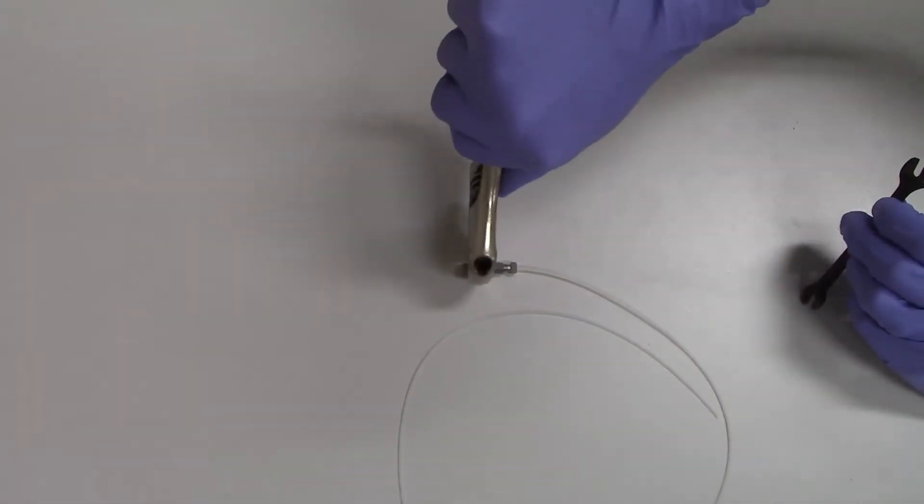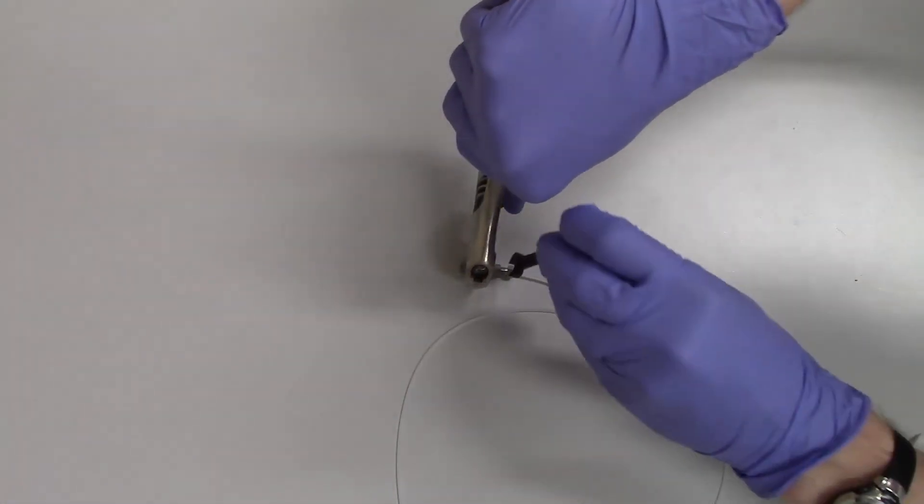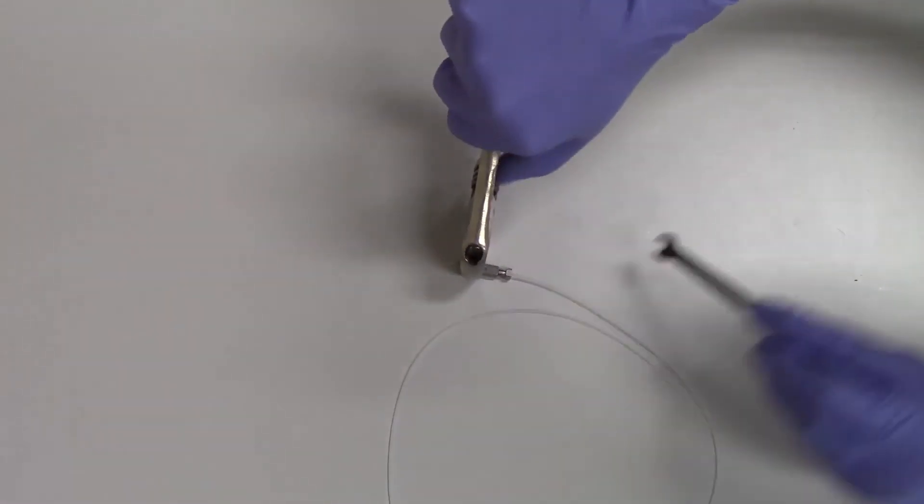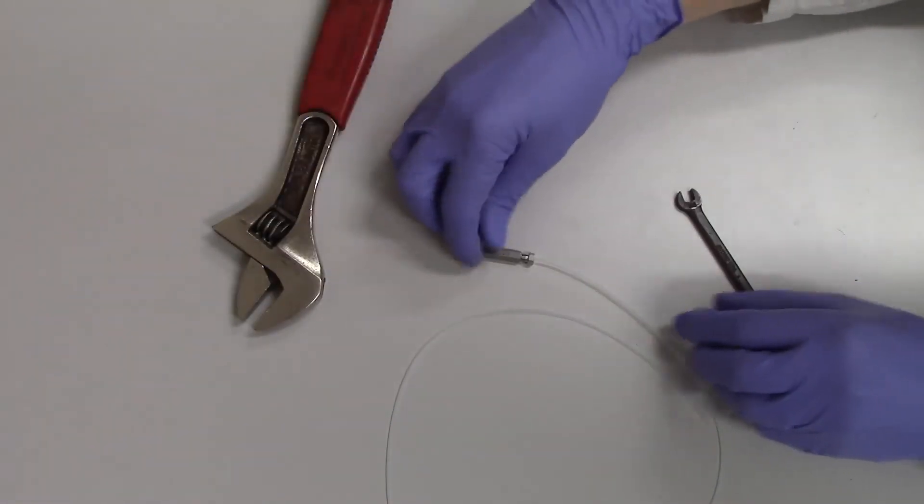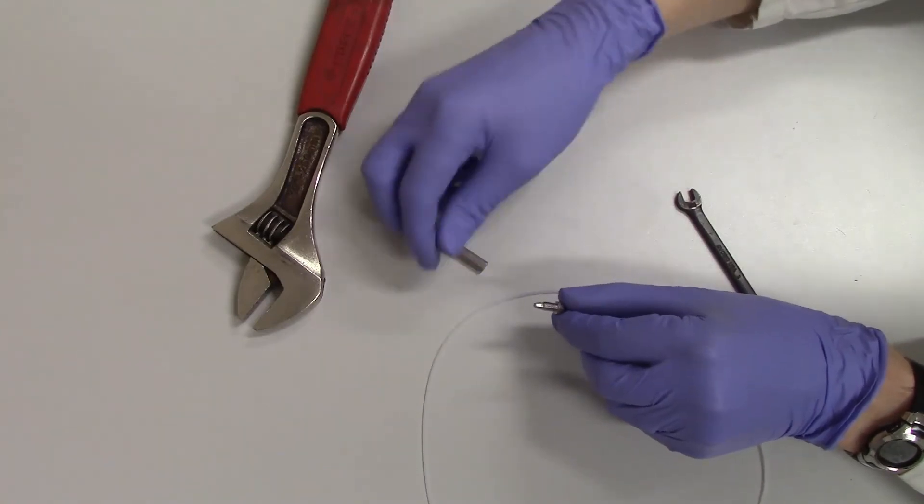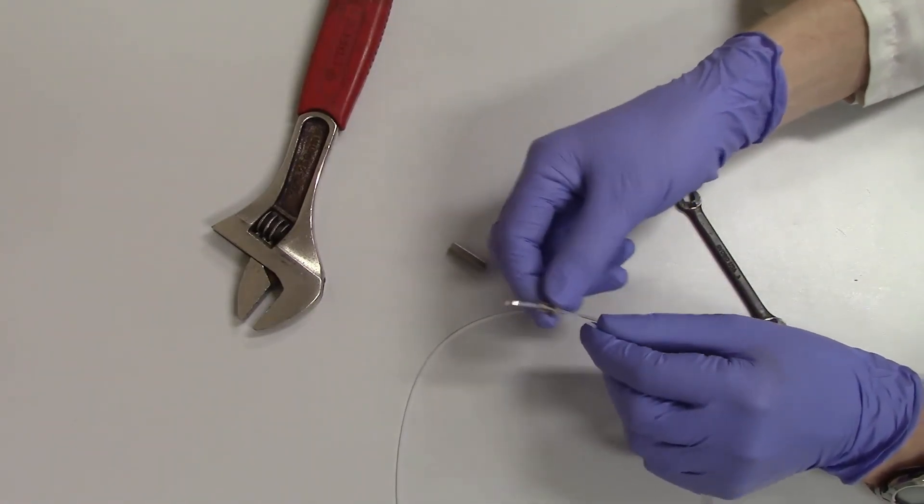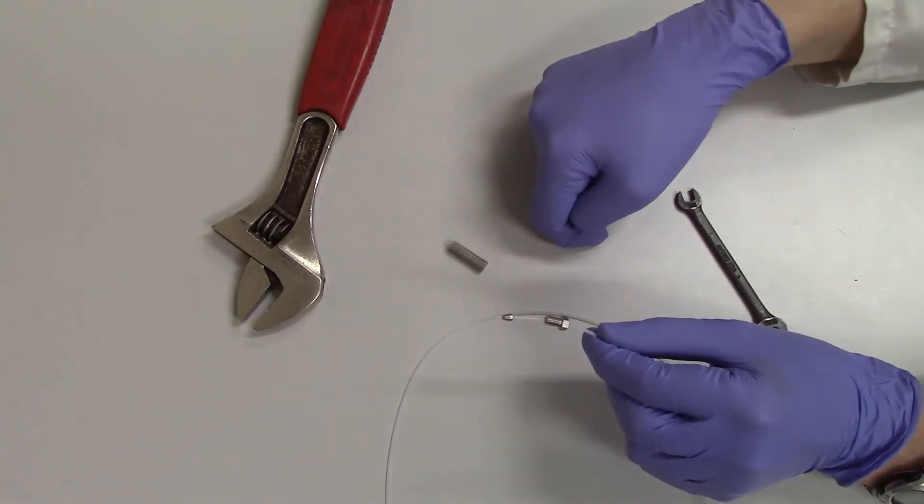Last, use the wrenches to loosen the nut from the connection piece. When it is removed, the ferrule should now be crimped onto the end of the piece of tubing, while the nut should still be loose enough to slide up and down and rotate around the tubing.